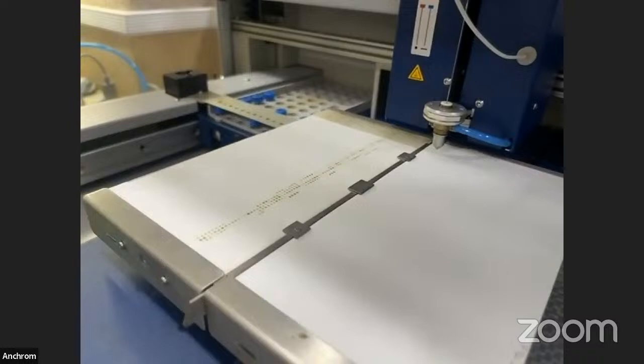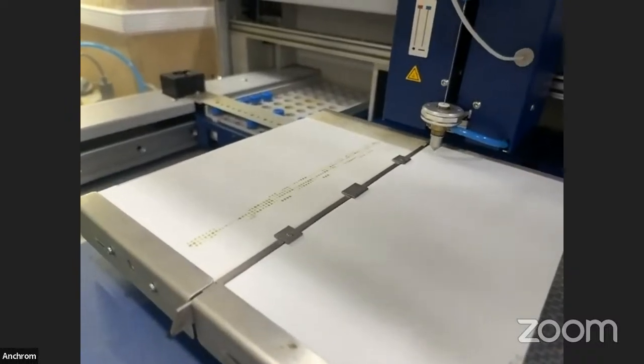Till these five samples are applied, we'll prepare the mobile phase for the development.